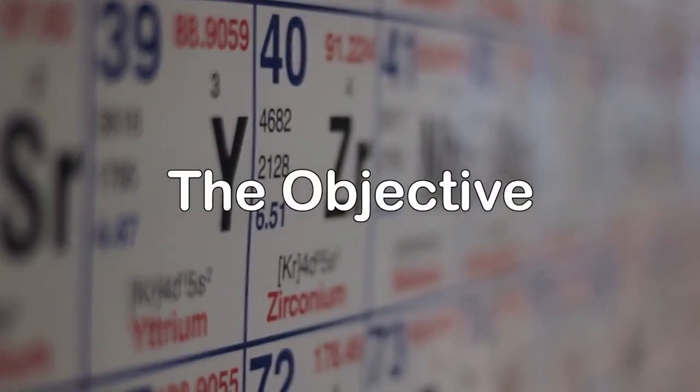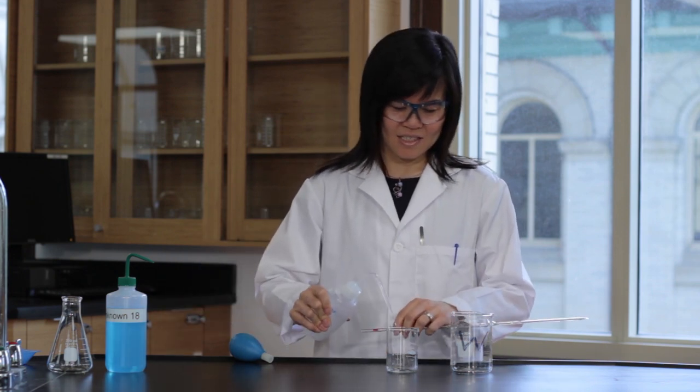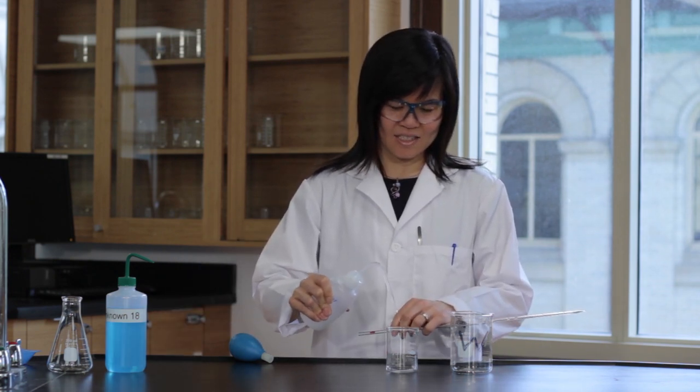To prepare a 10 milliliter volumetric pipette, first rinse it with distilled water. Add distilled water into a small clean beaker.